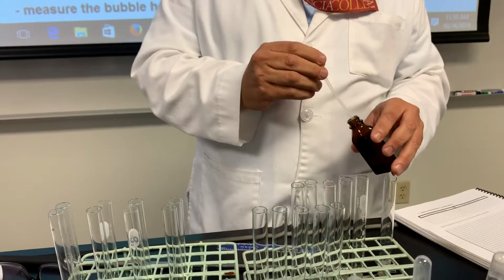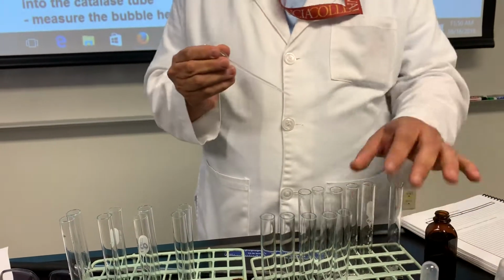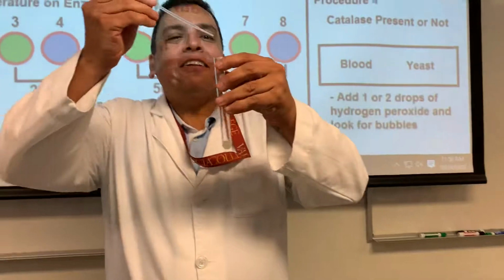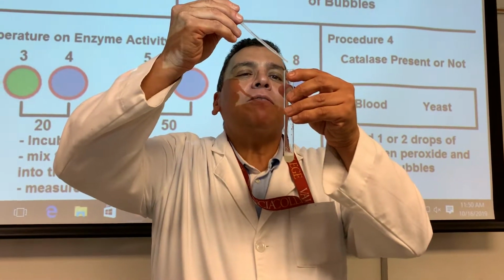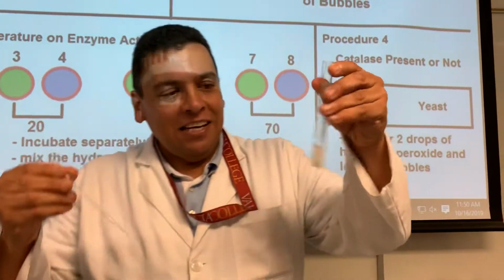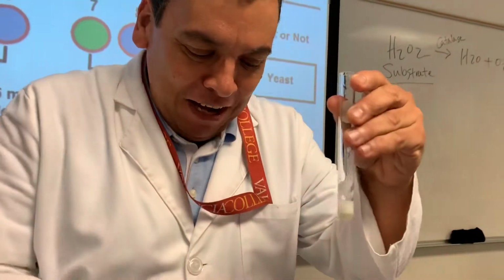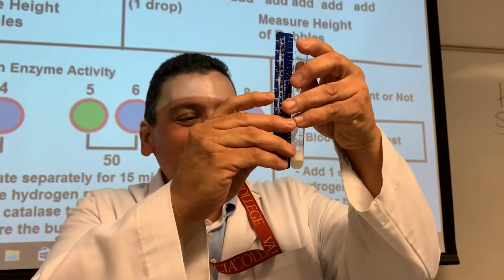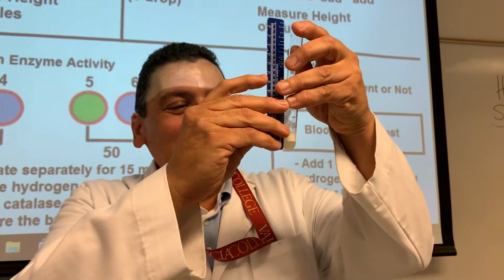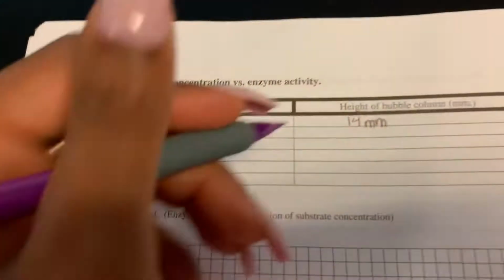That gives me anxiety. No, you're fine. I need to show you something. I'm scared you're going to hurt yourself, Dr. Saad. It's all right. I've done this before. 1, 2, 3, 4, 5, 6. Thank you. Just keep it going. Oh my God. There you go. All right, 20. Getting bigger.